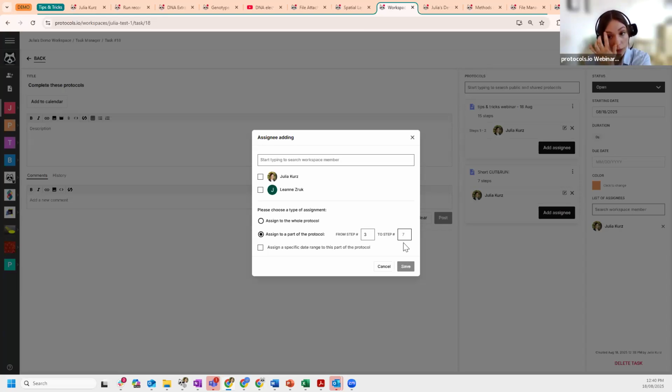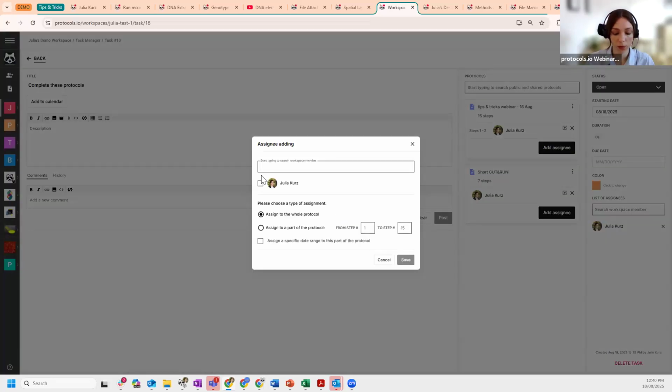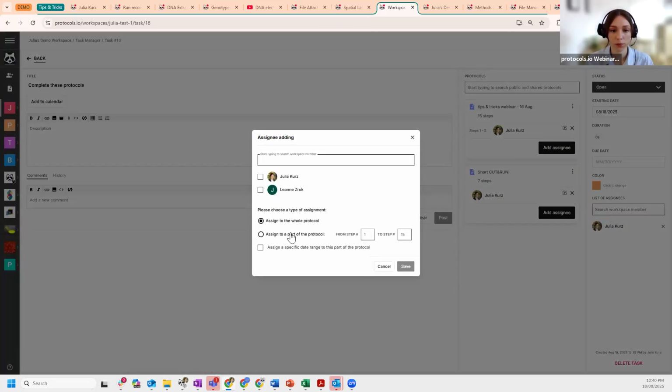Oh, I think I've selected the wrong one. I'll select this one. So I'll do then 3 to 15 for Leanne.